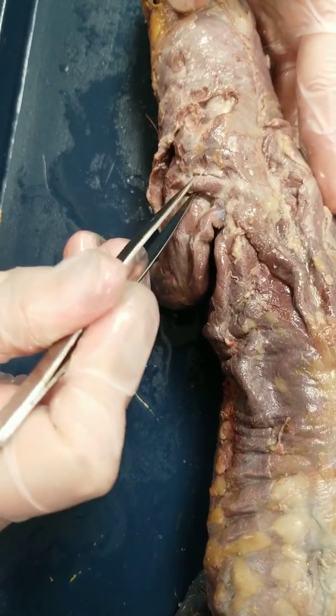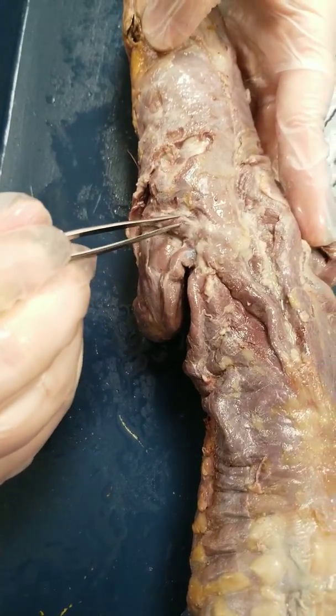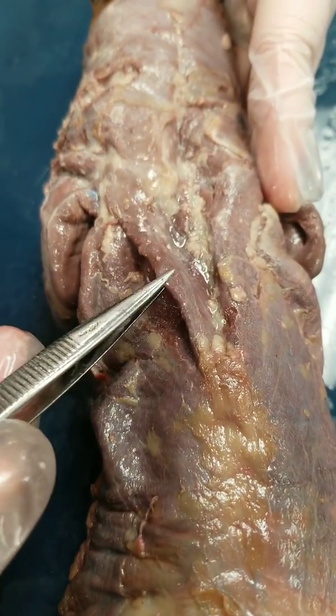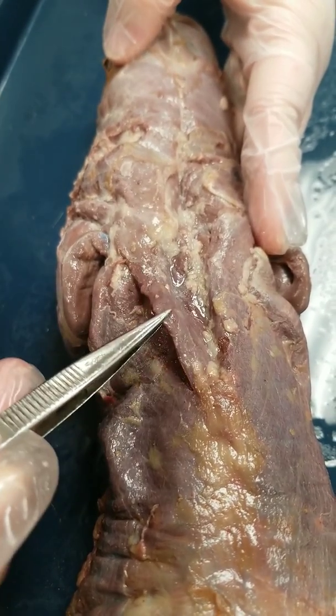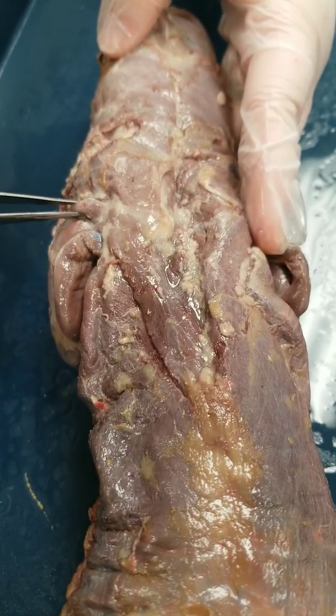Next you have the spinodeltoid muscle, and you're going to clean around each border to make it visible. The spinotrapezius is a little flap towards the back. You're going to separate it from the muscle underneath it and create a little flap. This is the spinotrapezius; this is the spinodeltoid.